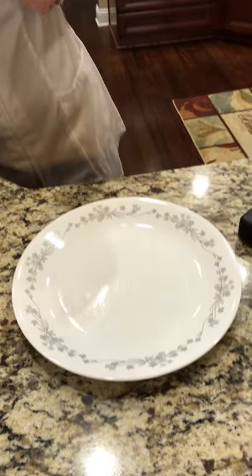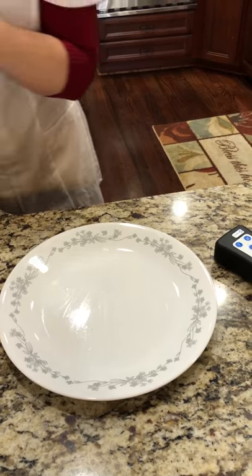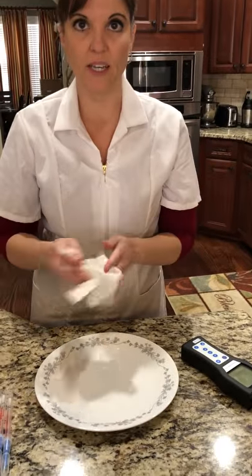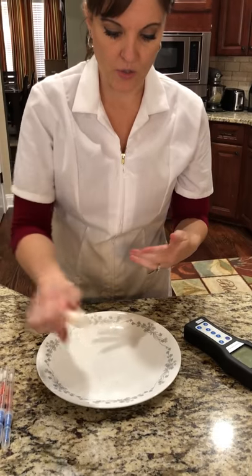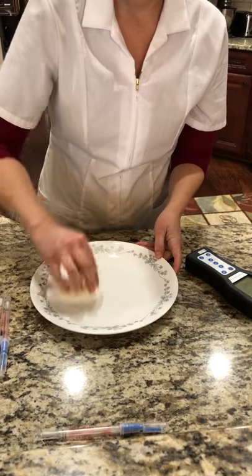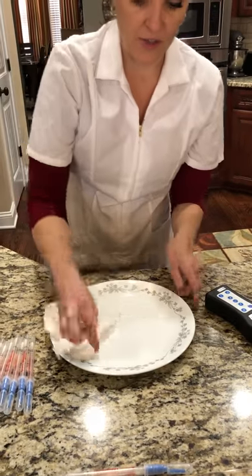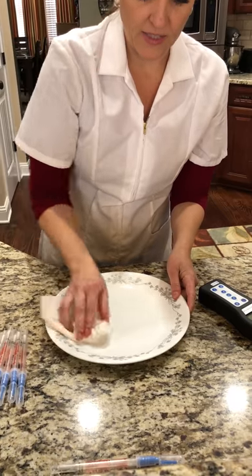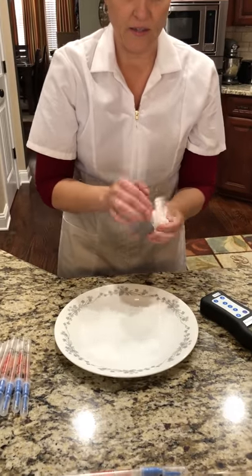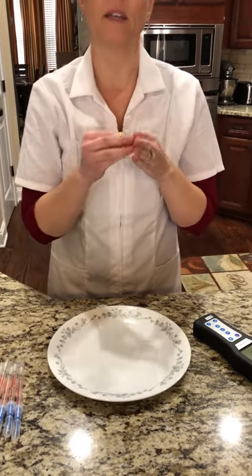We got that good and goopy. Now we cannot test surfaces that are visibly dirty or where you can see residuals, so we do need to dry it off. You're already wiping it off, but you still have bacteria and everything else staying on there. Anything left over will impede the swab's ability to read.